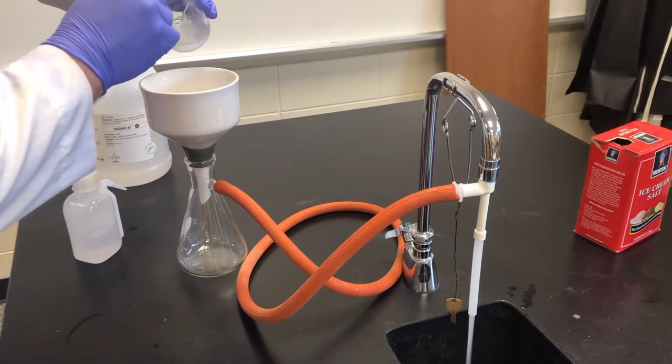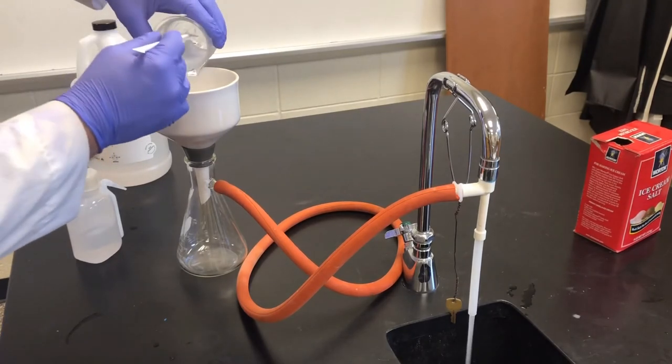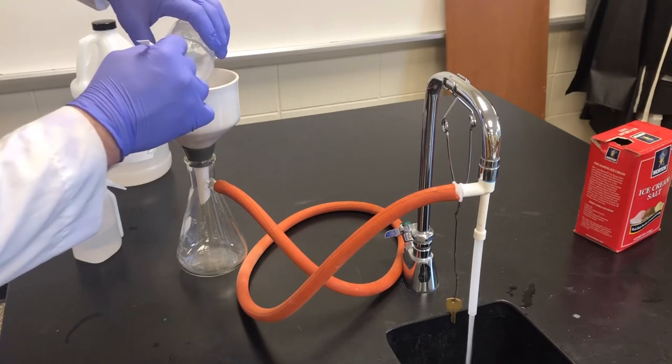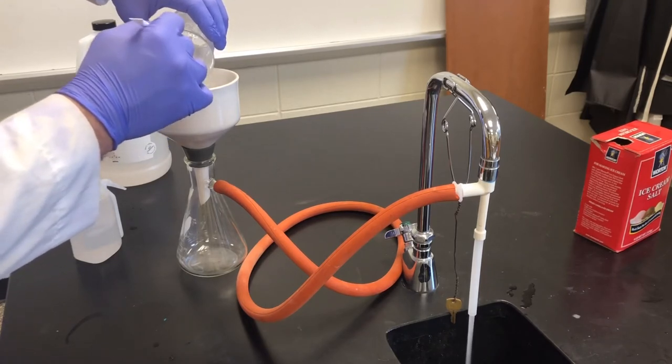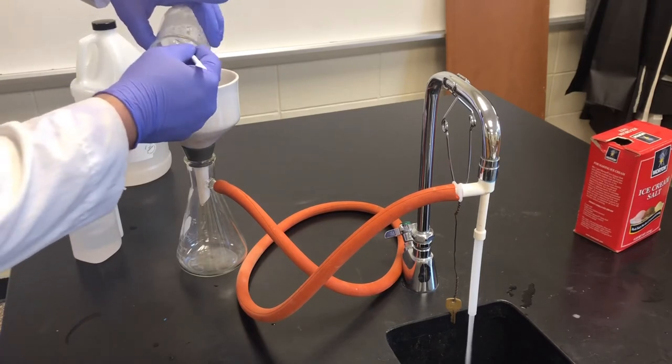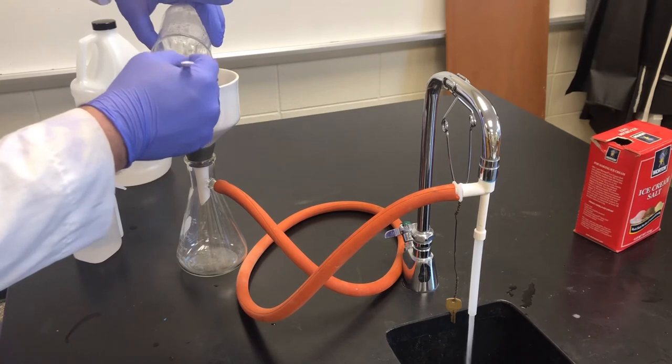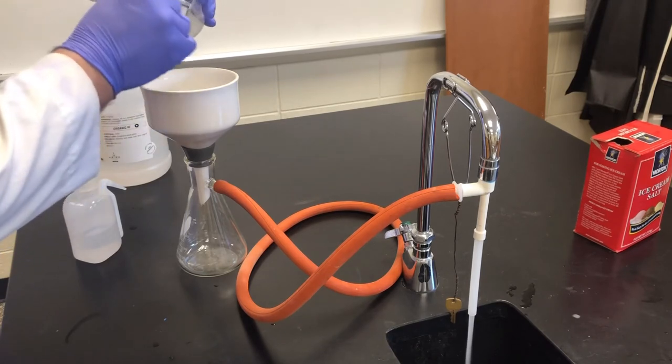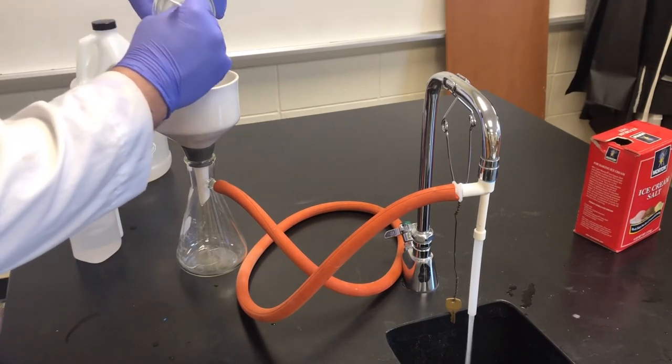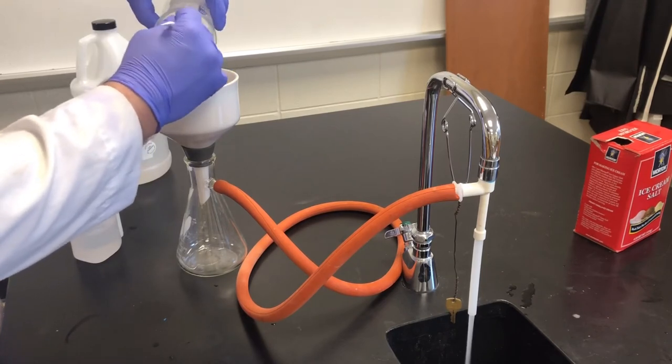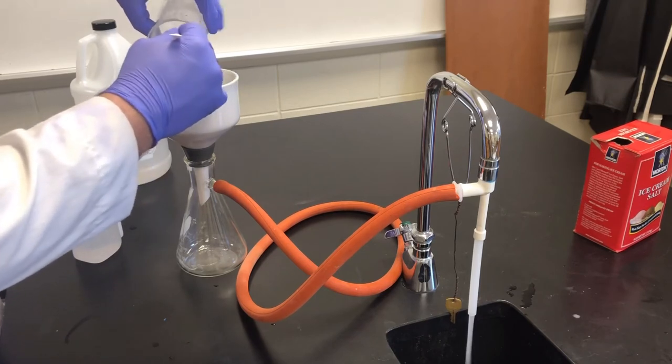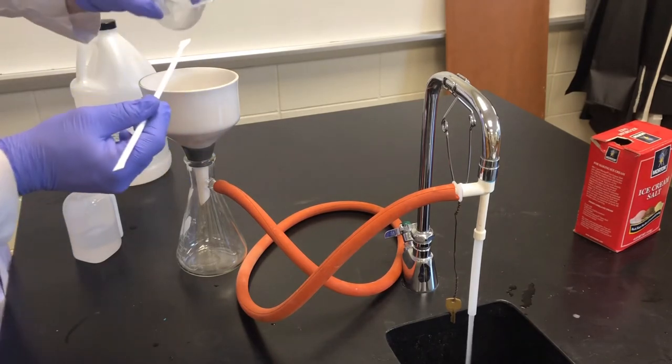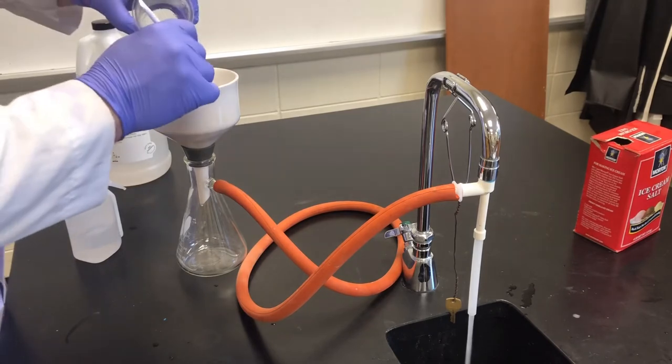As we turn this on, I'm going to try to get this into the very center so that it doesn't leak around any edges if possible. Remembering that if we can get every bit of this, that is going to improve our efficiency or our percent yield. The more we can get out is going to improve our percent yield. That is about as much of this I can get out just using the spatula by itself.